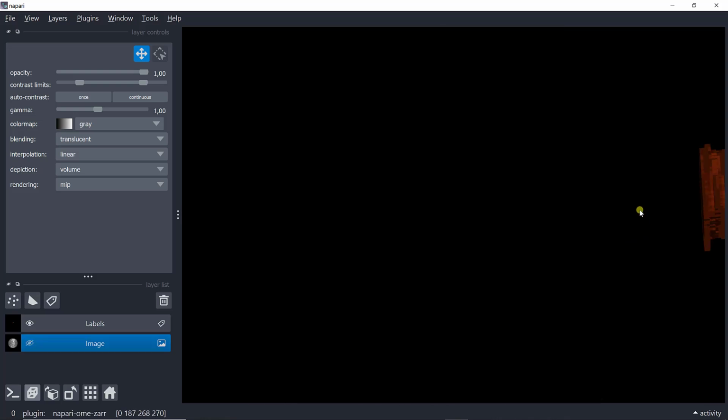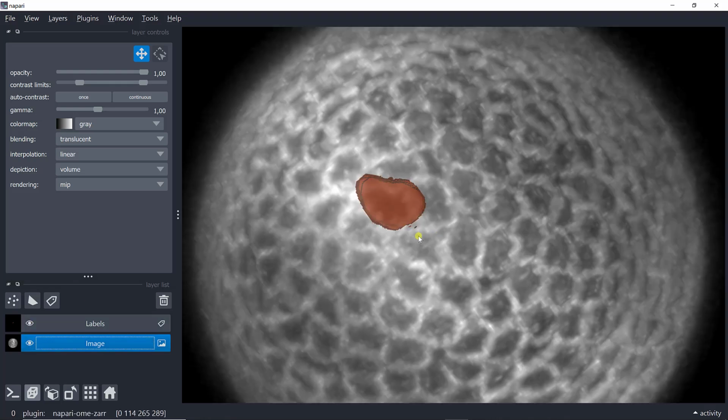All right, let me go back this way. As you can see, as I annotated plane per plane, it looks like you have this step effect, which is probably not ideal, but I have this image. You can go back to the label, so with the image to see what it is.